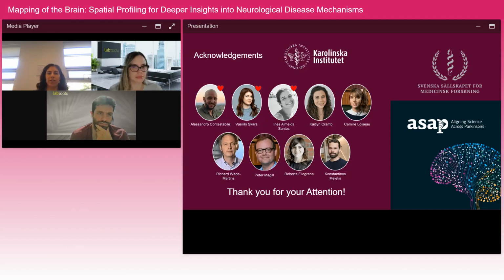Those panels are off the shelf, so as soon as you decide that you're ready to order a panel, it can be shipped out to you. Whereas custom panels are custom made, so the shipping time is a little bit longer. If the pre-designed panel fits your research question, it's easier to start there.